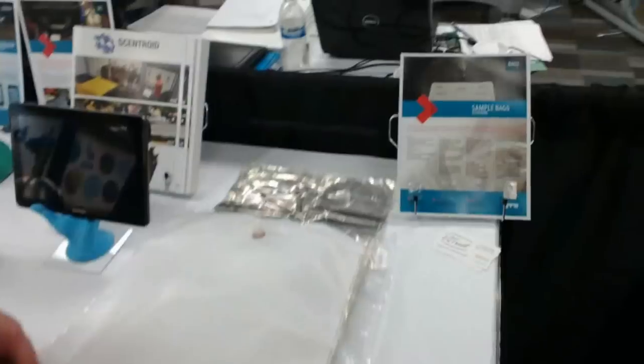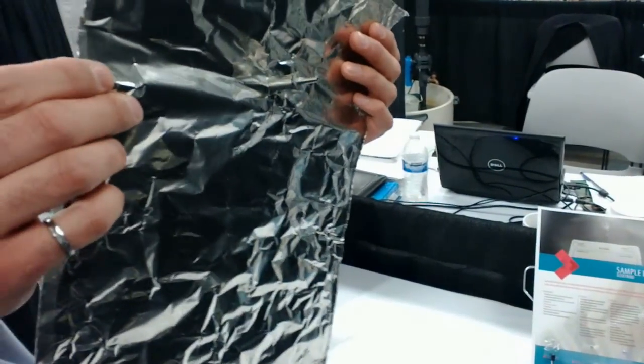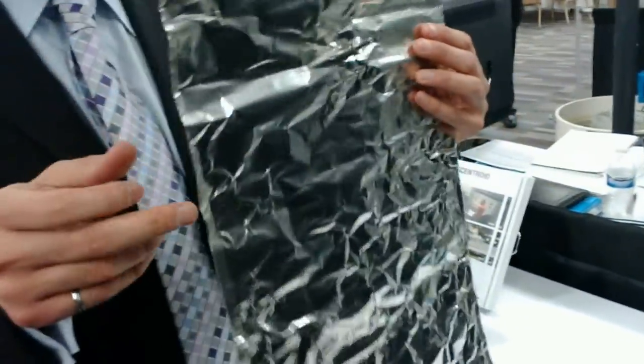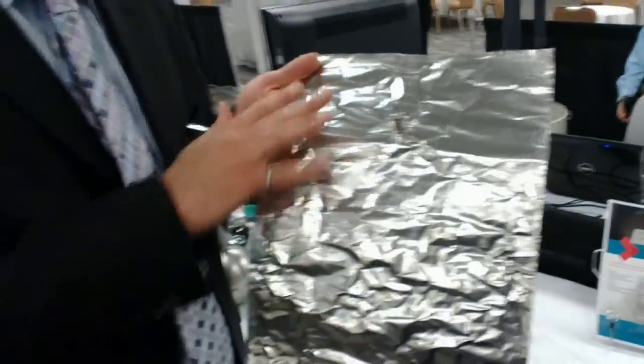We also sell this one, which is for a special purpose. It's stainless steel — pure stainless steel, we weld across. I put tape on it just so you don't cut yourself, but it's actually just stainless steel. And this one, of course, nothing goes through and nothing sticks to it.